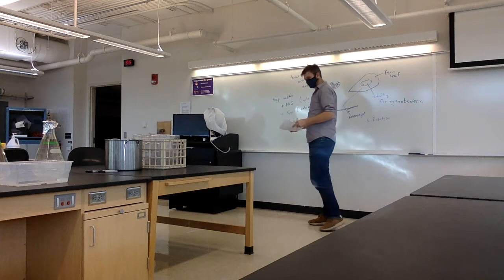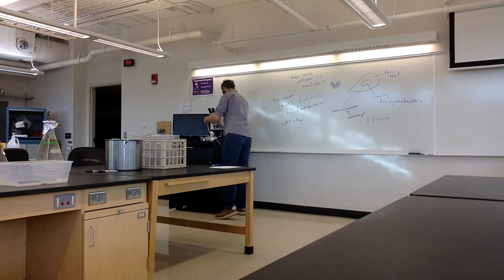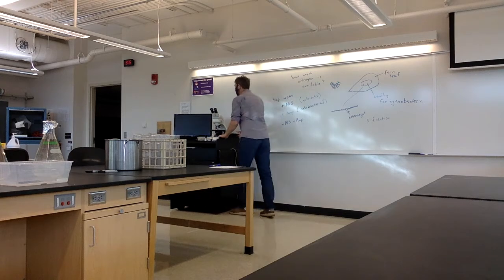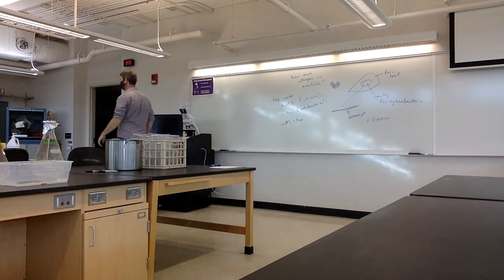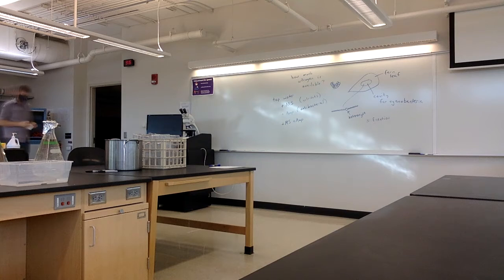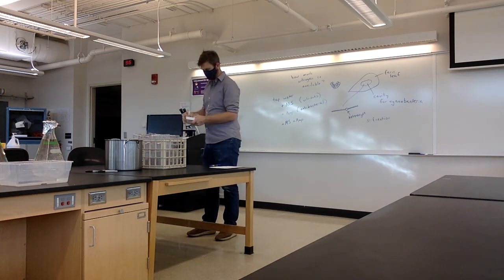So I guess early on, if we want to set up an experiment where we are farming the native cyanobacteria, probably make sure they're in there. Anybody have thoughts so far? That's pretty good.